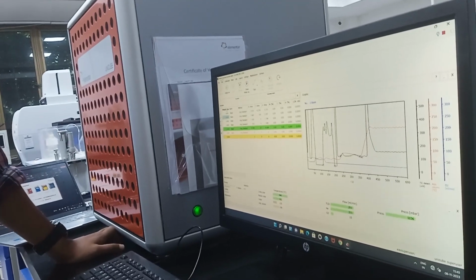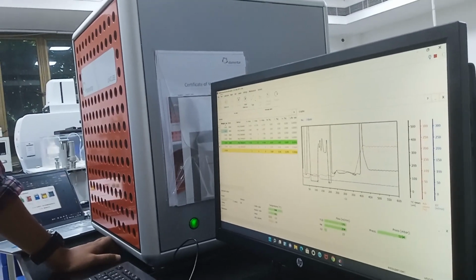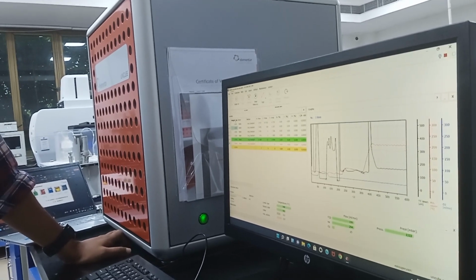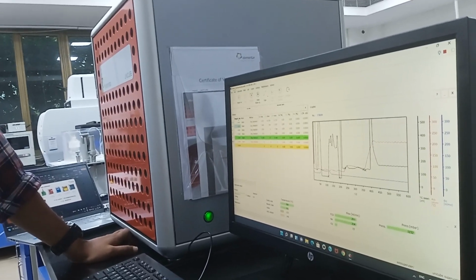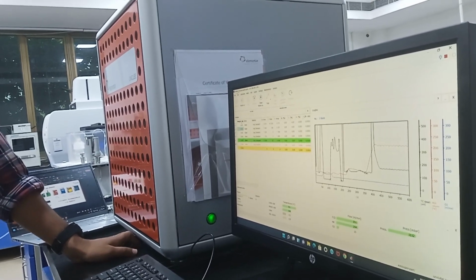The sample you are taking and weighing is giving some X weight, and that you will insert. Without any reason, why will you put 2? Okay, you can put 2. I am not saying you can't. It gives the same results for the blank whatever you put. Some number should be there. So it's not necessary that the blank weight and the sample weight should be the same.